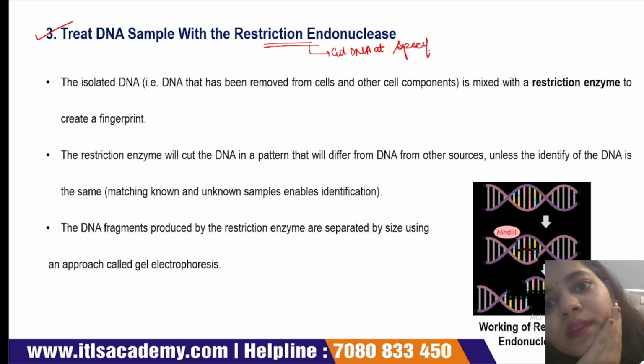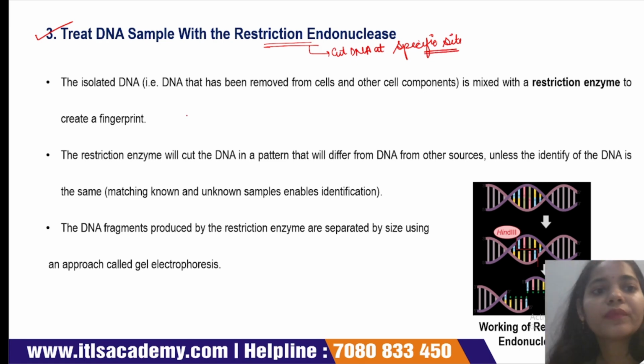The isolated DNA is mixed with the restriction enzyme to create the fingerprints.